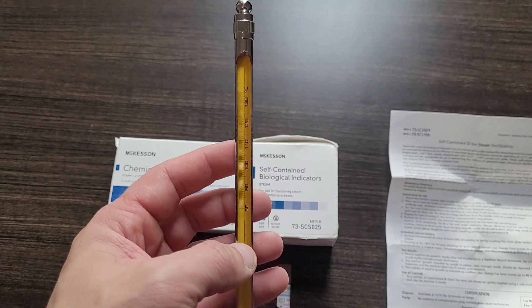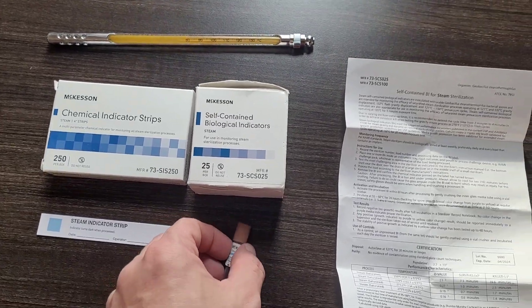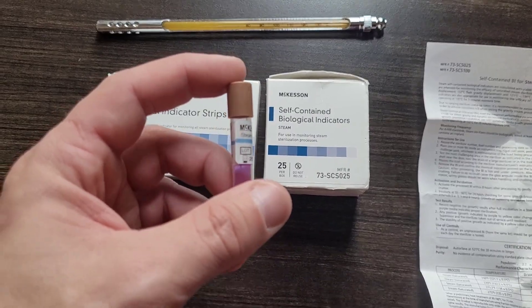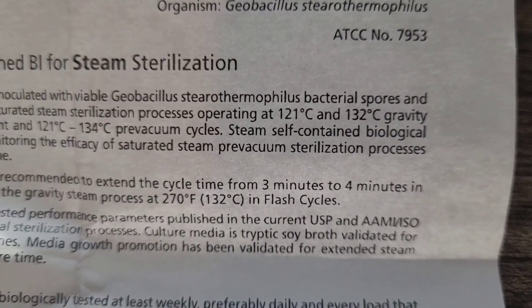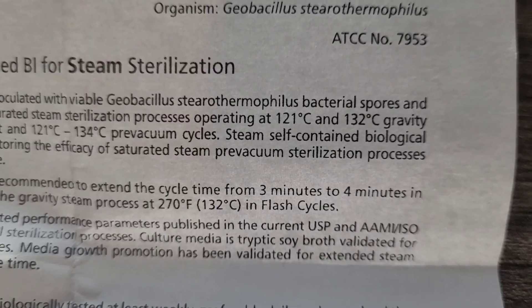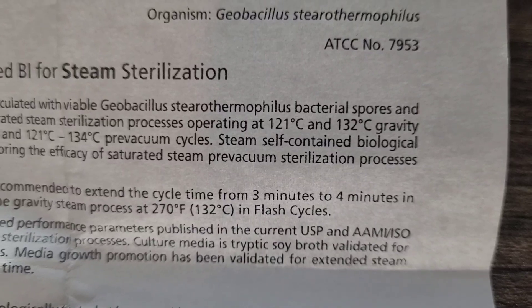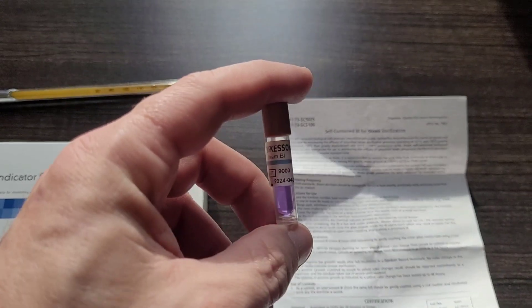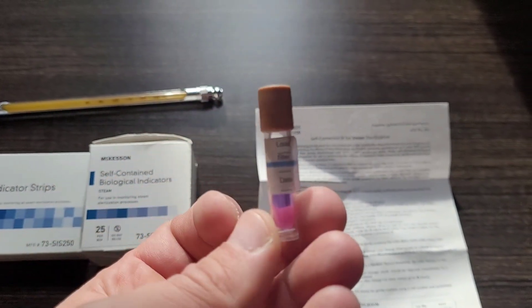These thermometers are quite expensive, but they are excellent to use in conjunction with the benchmark validation for autoclaves, which is the self-contained biological indicator. Each biological indicator contains Geobacillus stearothermophilus, a species of thermophilic bacterial endospore. Each ampule contains roughly 10 to the 6 spores, and each ampule has its own external chem strip indicator with a blue line.